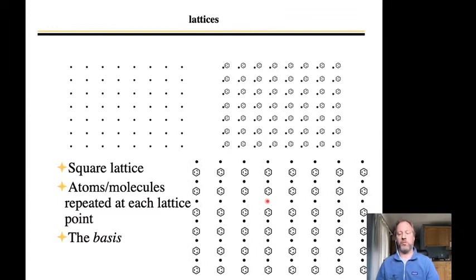In some crystal systems, you have to put one of the lattice points at one point because it's a special point, like an inversion center. And if your molecule is sitting on that inversion center, then you should put the point there. But in general, the lattice points are generally movable. So if you have crystals filling space and you just draw an imaginary mesh around it, you can move that mesh around and still fill space. But the position of the lattice point relative to the basis is going to be different. But there is a relationship between the point and the basis once we start solving the structure.